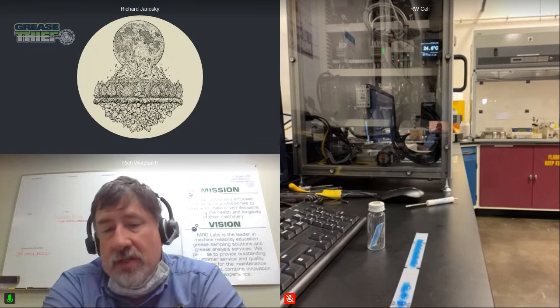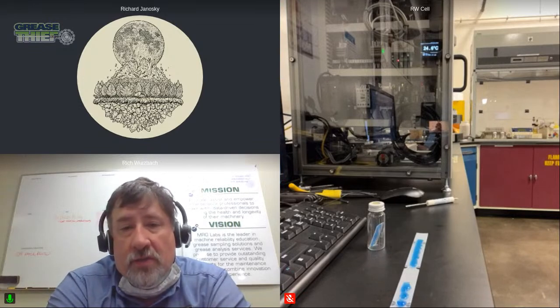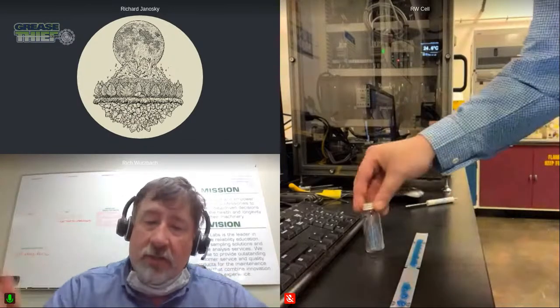Everything that you've showed us here today in terms of measuring these small quantity characteristics of consistency and particle counting, and then also the preparation from the substrate, impacts every other test that we have going forward. And there are other ways to do it. There's a lot of labs that are offering to do grease analysis, and they do PQ analysis, particle quantification.